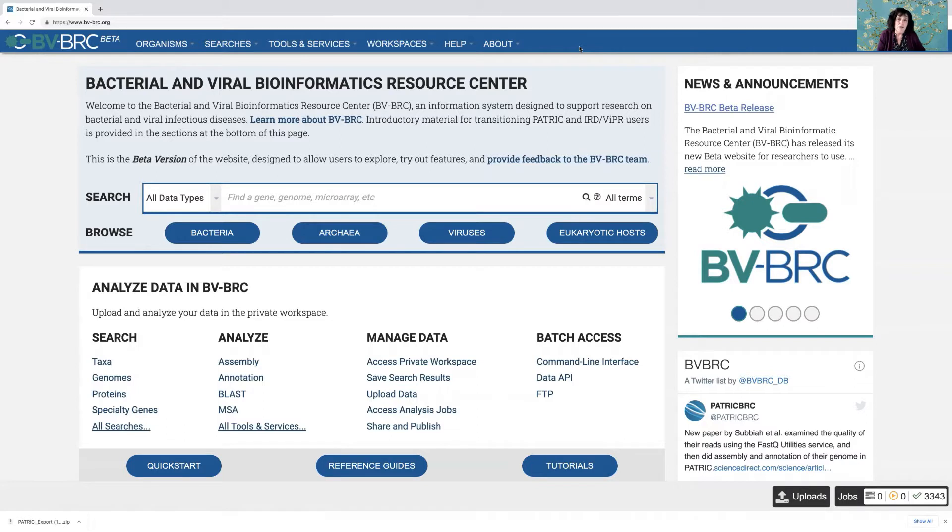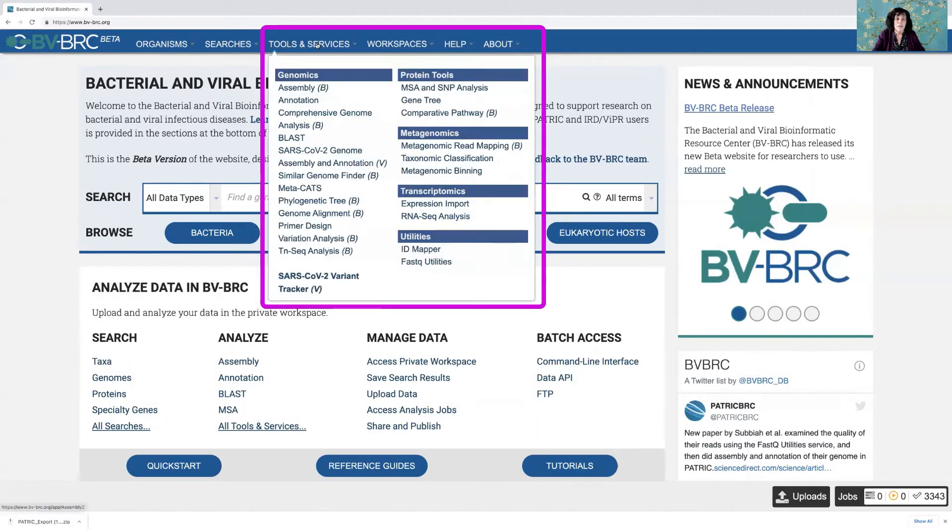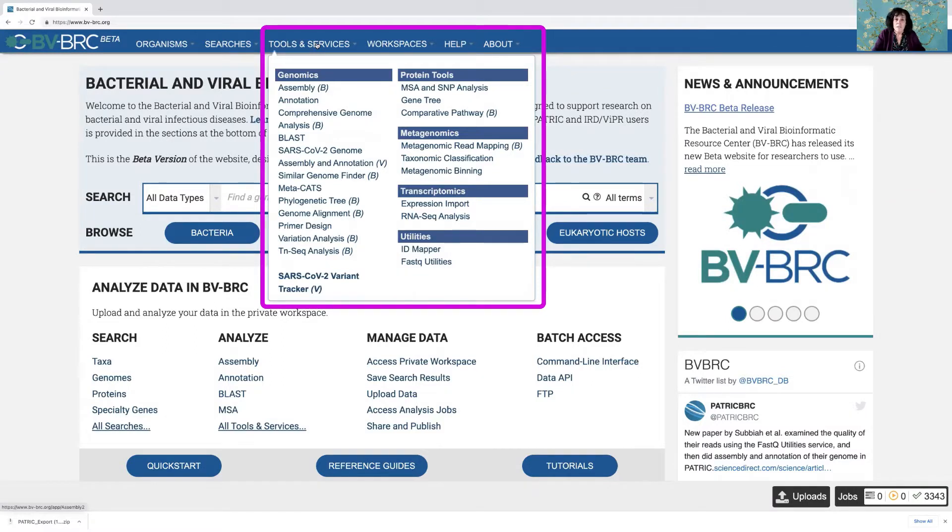So today I'm going to show you how to submit jobs in BVBRC. Let's go to the tools and services tab at the top. So click on that and that opens a dropdown box that shows you all the services and tools that we currently have in BVBRC and we do add them from time to time.